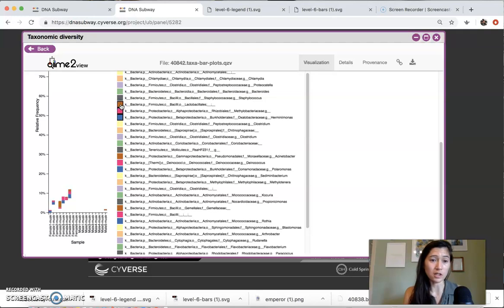If you click one and decide you don't want it, so that one is present in females and males, we don't want that one, you can click it again and it'll go away and return to just the 2 that you had clicked before. So play around with that and identify some differences between males and females.